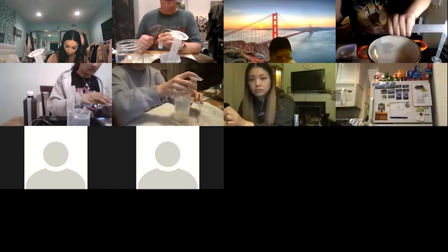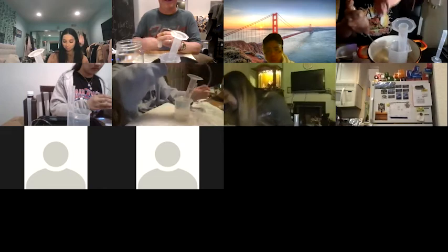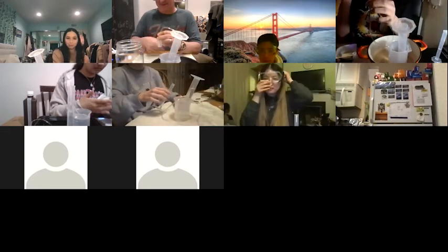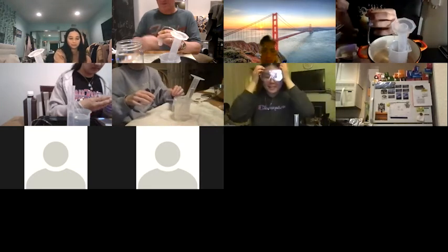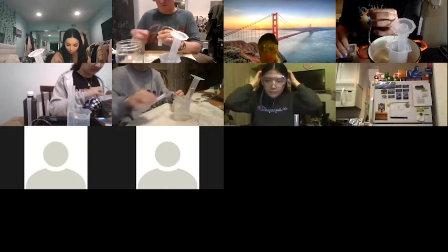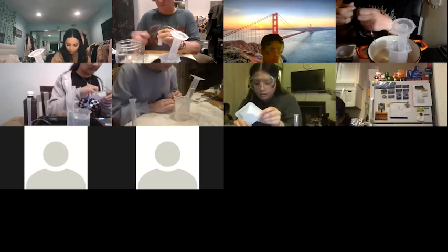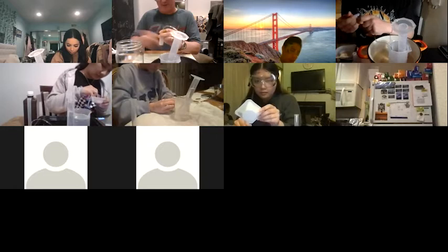Megan, you're not wearing your goggles. Thank you. You wouldn't want to get yeast eye, would you? I mean, come on. I'd never forgive myself if he came down with a case of yeast eye. I mean, we are playing with peroxide, so you definitely wouldn't want to get that in your eye.